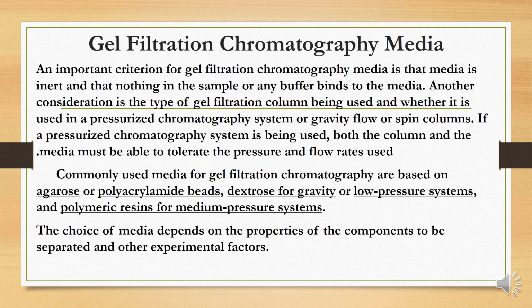Gel filtration chromatography media. An important consideration for gel filtration chromatography media is that the media is inert and that nothing in the sample or any buffer binds to the media.